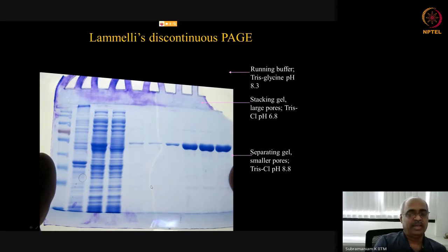Okay. So I hope you have understood this concept quite clearly. This is very important because this will keep reappearing in biochemistry or in doing experiments in multiple contexts. So therefore, pay attention to remembering the basic chemistry behind the SDS-PAGE.